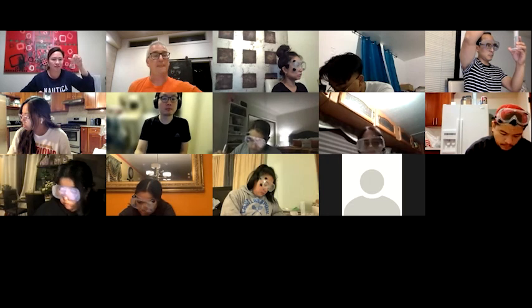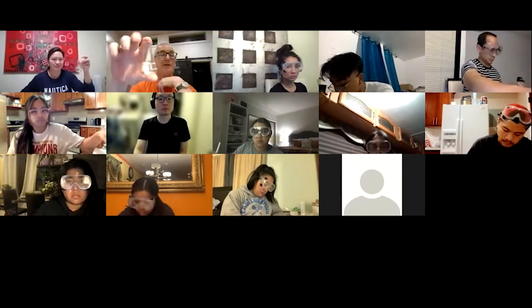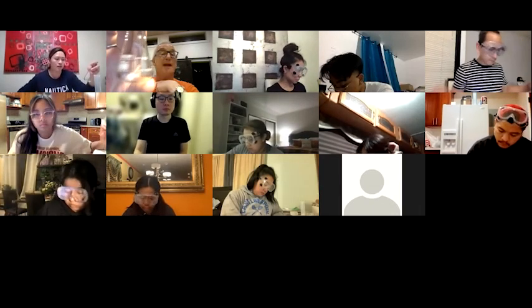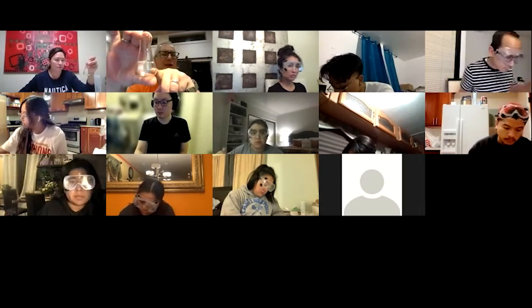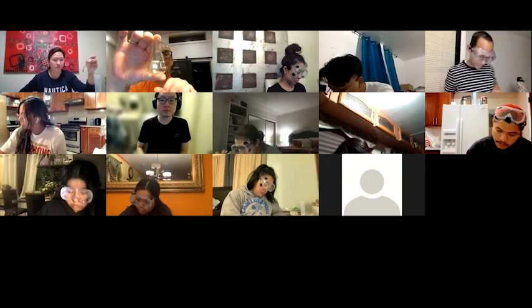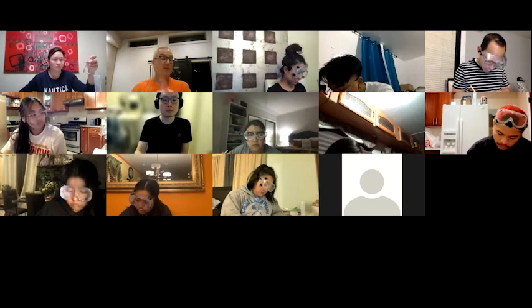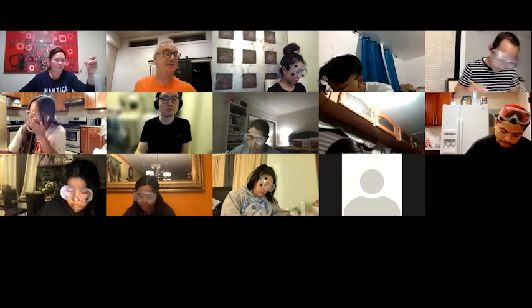Same thing with this one. On this one, the intervals are actually written on it. Yeah, just the 12.5 to 25. Yeah, that's it. Oh, okay. But because this is a conical shape, it's really hard to know where midway is in between there, because it's not going to be in the middle, is it? Yeah, because it gets smaller. So the midway point is going to be closer to 12.5 than 25, which is why this is such a crappy measuring device. And we don't use it for that.